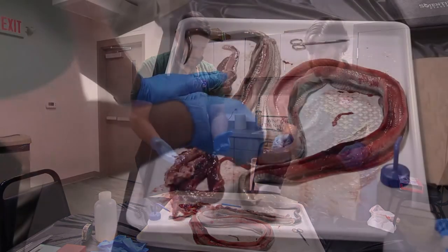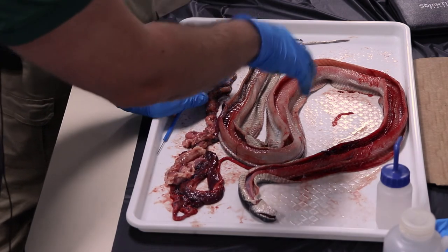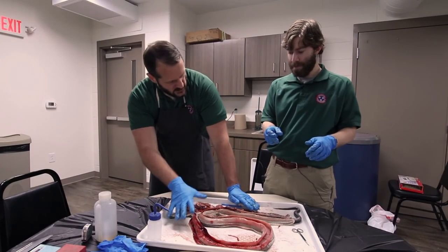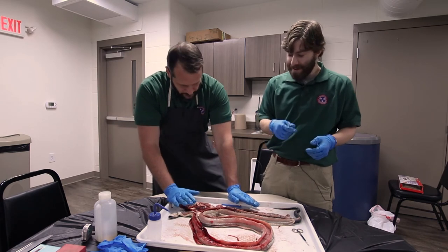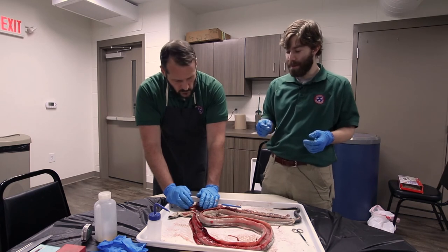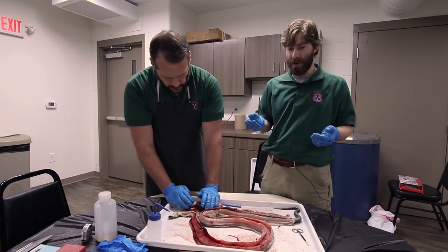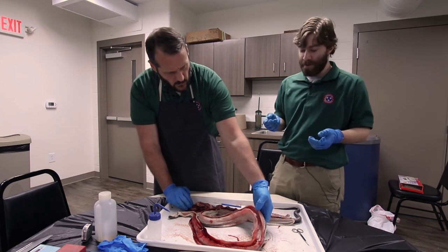Too cool. All right, so now, Lance, we did this so folks at home could have something interesting to watch, and hopefully you learned something along the way. But we didn't just do this for fun. Why did we do this to this snake here? This snake is actually going into our research collections, or osteology collections. So it's going to end up as a skeletal specimen, just the skeleton, and we're actually going to preserve the skin as well. So future researchers who want to do research on snakes can come utilize our collections for that purpose.